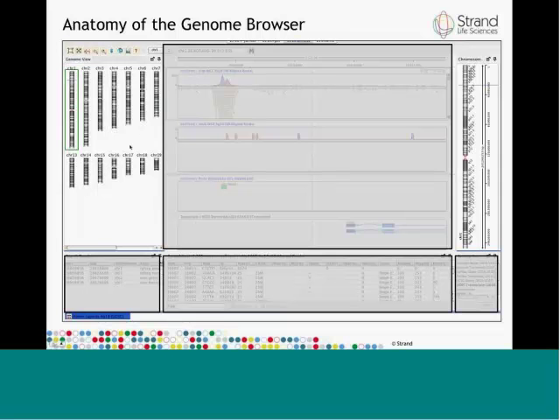This sidebar on the left is the genome view. It shows us a picture of all the chromosomes of the organism, or more specifically the build that is being used. The chromosome that is currently being displayed is highlighted with a green selection border.